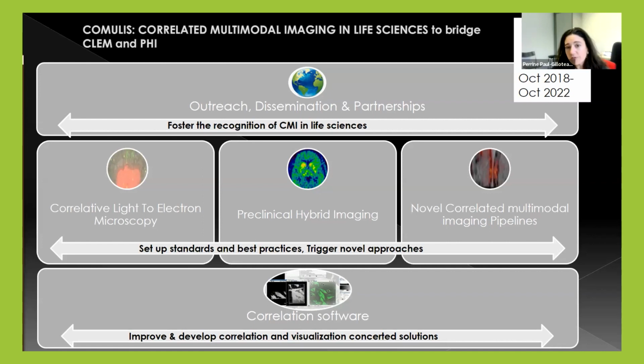We got this funding and we organized in different working groups, some of them trying to gather the knowledge about these pioneering correlative microscopy workflows from CLEM, also people working from the preclinical hybrid imaging field, these integrated systems as well, and working together also to develop new correlated multimodal imaging pipelines, maybe spanning the different scales also.